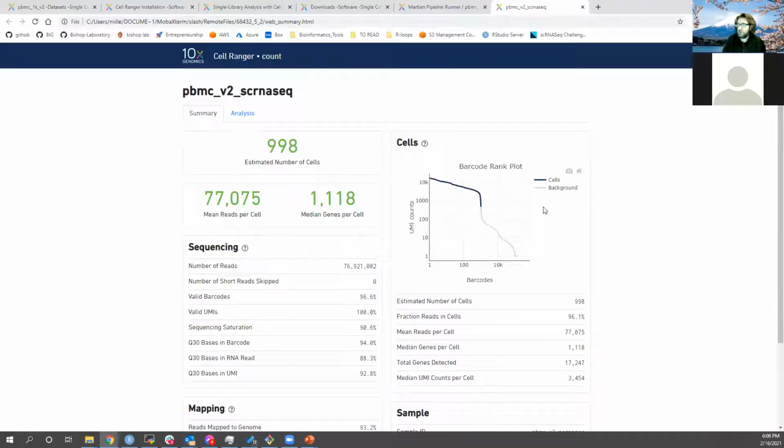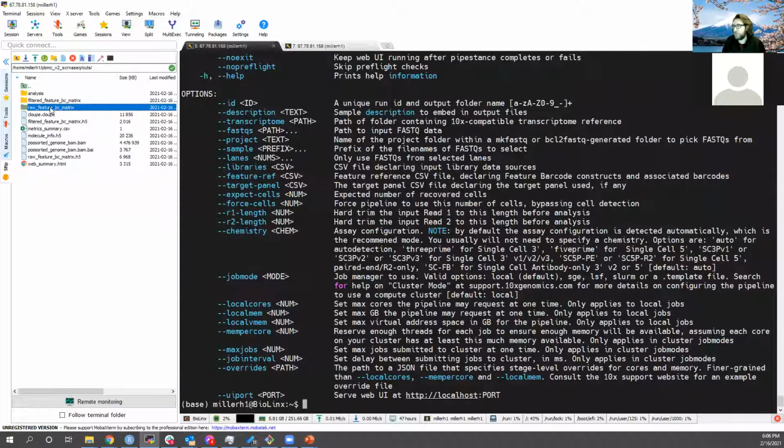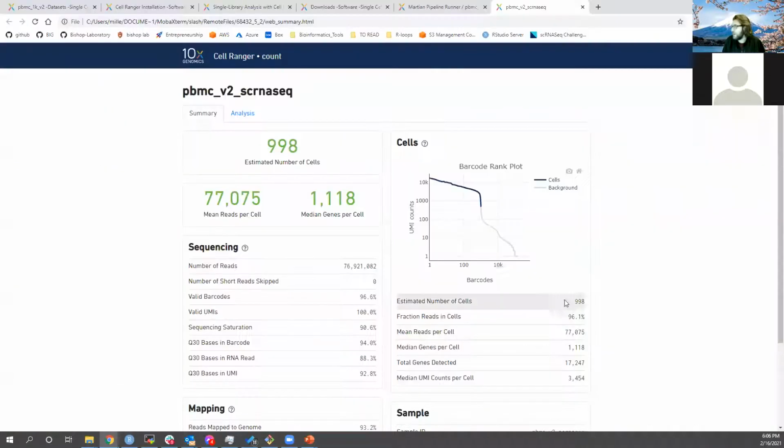When you do your analysis in scRNA, you can actually start from the raw feature barcode matrix, which you can load using the read 10x function. And then this will be everything, including the supposed background. So you can set your own cutoff and you can decide for yourself. But I typically will just let Cell Ranger decide, and then I'll typically get more stringent from there.